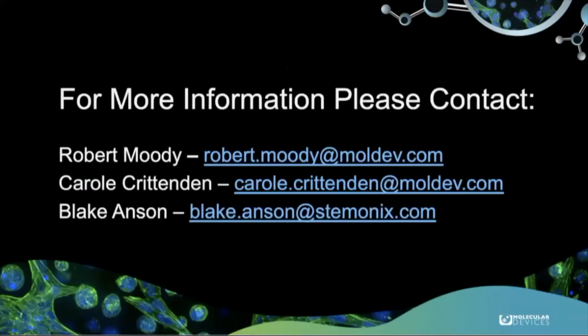Thank you. One question is, can large molecules access the microBrain spheroids? Yeah, they can. Thanks, Robert, for the question. All of the data that we presented here was with small molecules, but we also have a variety of customers using large molecule approaches, including various RNA modalities, ASOs, as well as antibodies. And also we found that the spheroids, even though they are 3D, are amenable to viral infection or transduction.